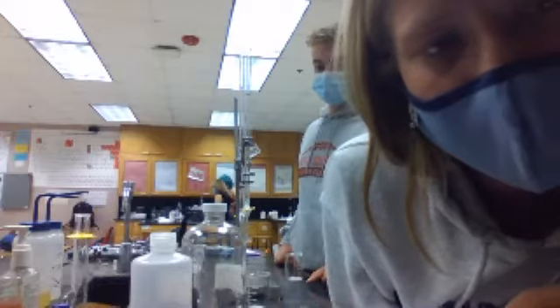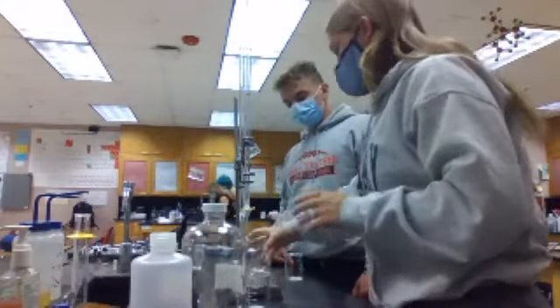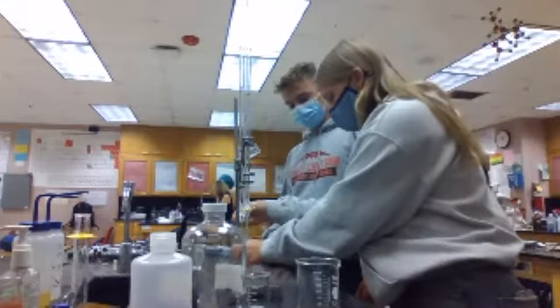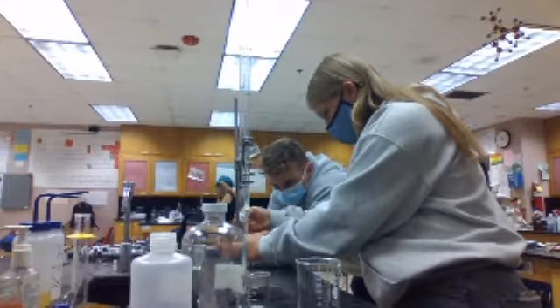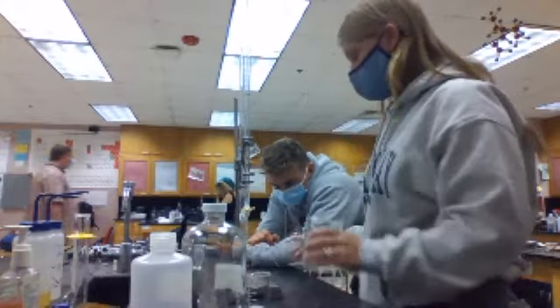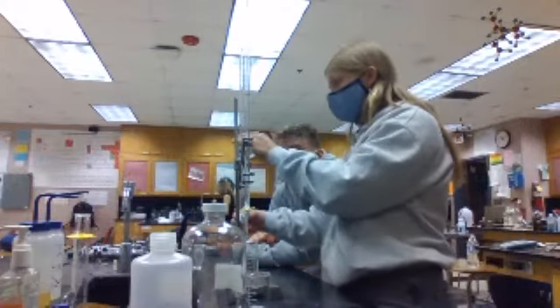Okay, so we're going to take the pH of 10 milliliters of the acid, and you need to find the inverse log of that, so the H plus, or the molarity of the acid. What was the amount you calculated for the concentrations? Concentrations cancel out, so they're both one. And then it should be the molarity of the base divided by the volume of the base. We don't know the volume.